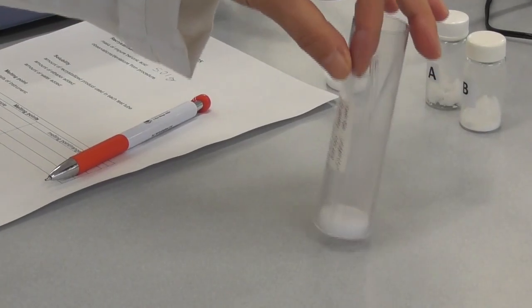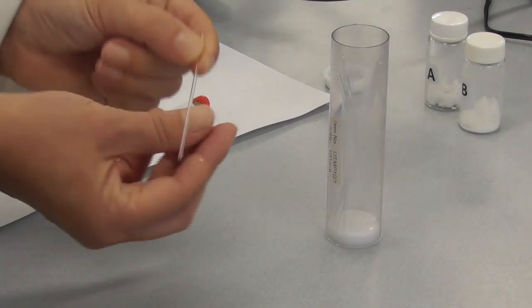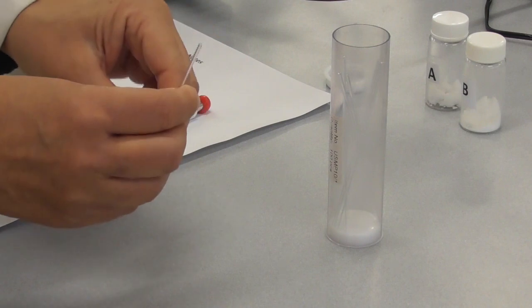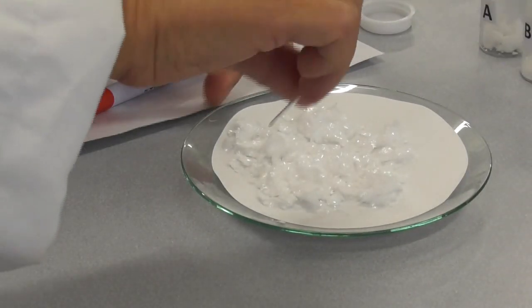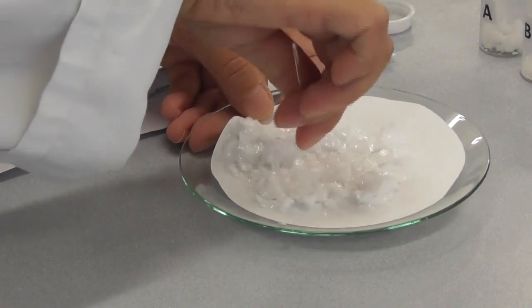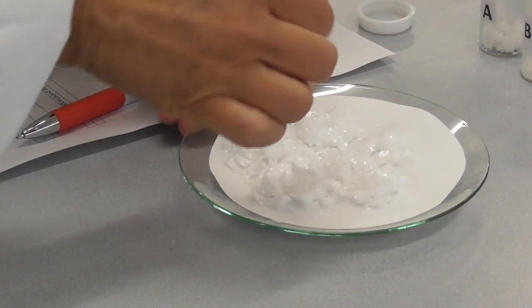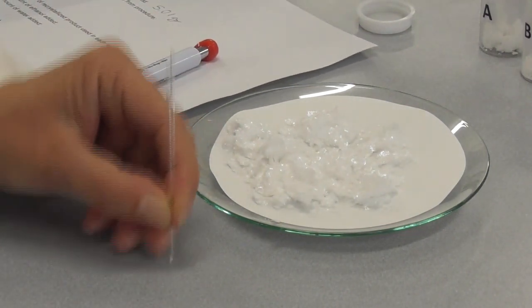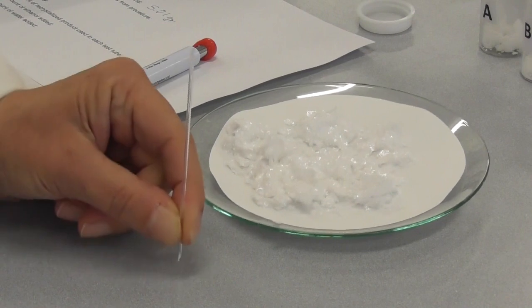To determine the melting point we need a capillary tube. These have one open end and one closed end. We dip the open end into our crystals on the filter paper to get some of the crystals into the tube and then gently tap it for the crystals to fall down into the tube.